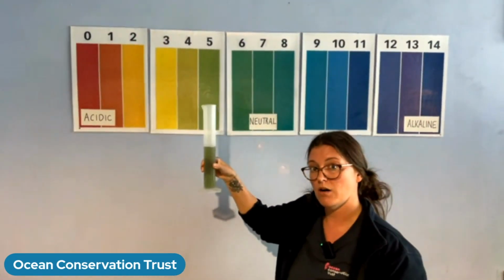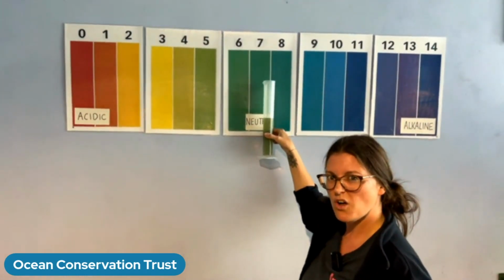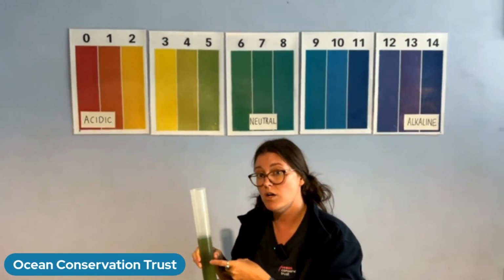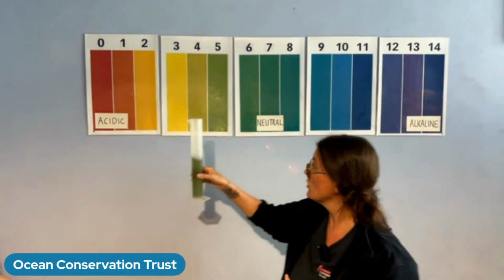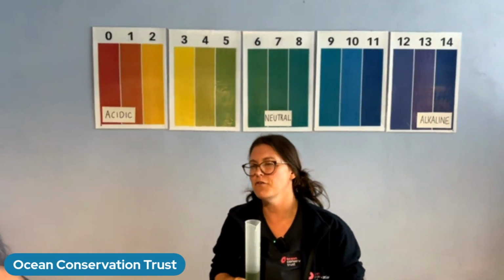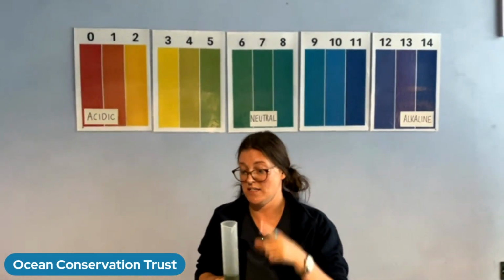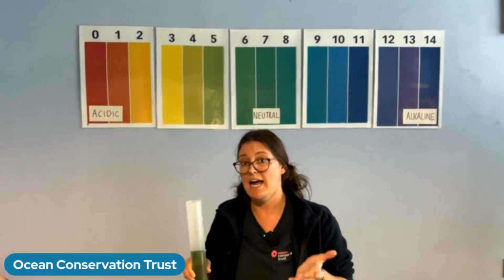And if we were to think about our oceans, then they're sitting at about 8.1. They're about here on the pH scale, which is great. It's neutral. We're happy with that. But what happens to our ocean when carbon dioxide is added? What happens to the levels? We're going to do a little experiment now to find out. I've got a few friends who are going to help me along, and these friends are all very invested in the health of the ocean. And they are going to add carbon dioxide to their beakers to see what happens and how it changes.